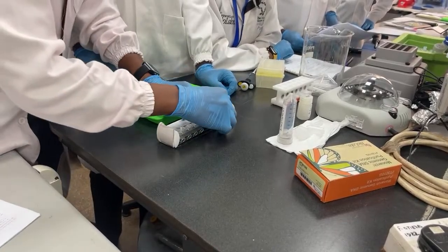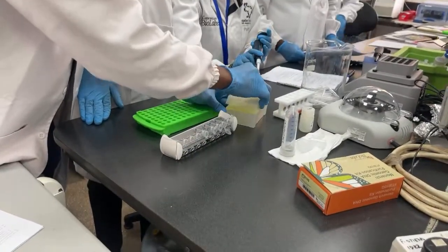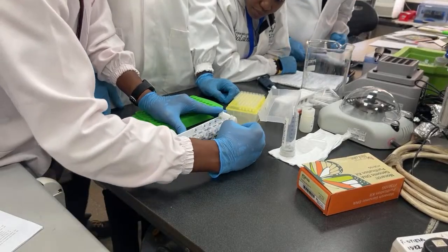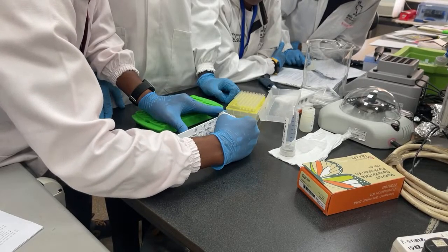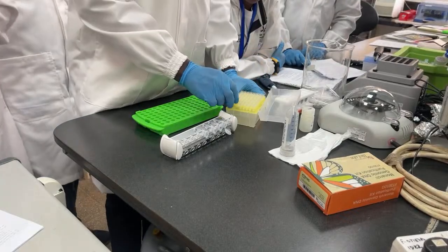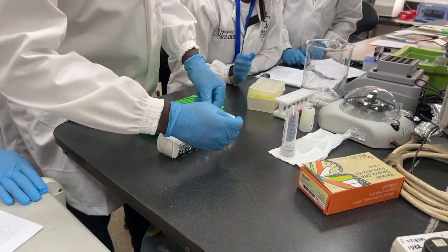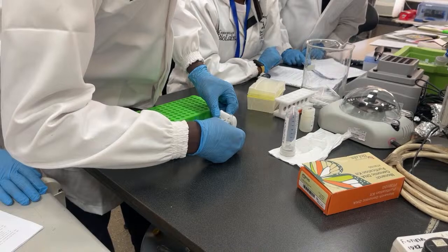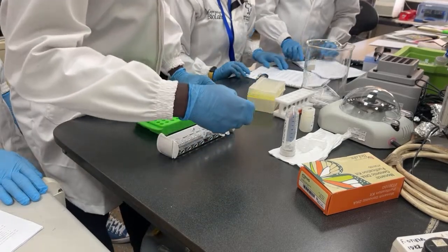So carefully you open, then with the tip, just the tip. At this point the DNA is tightly bound to the disc. You just push it to the side so that you can access the liquid. Somebody can do that. First put the disc on the side and then come back in and extract the liquid.